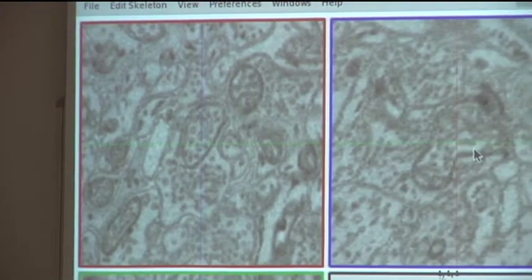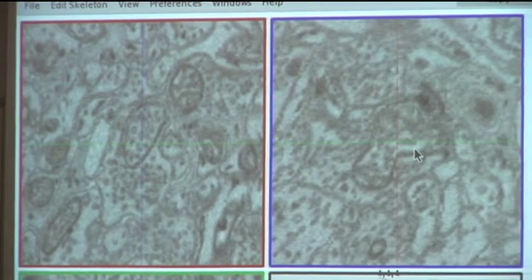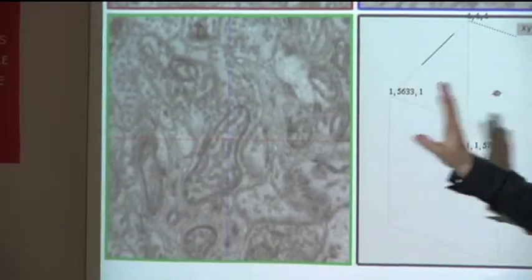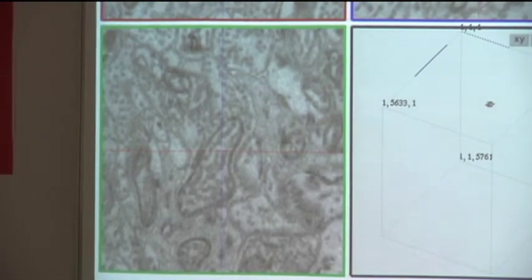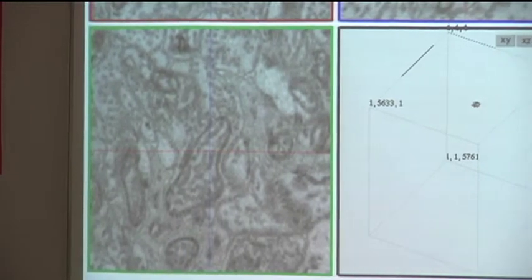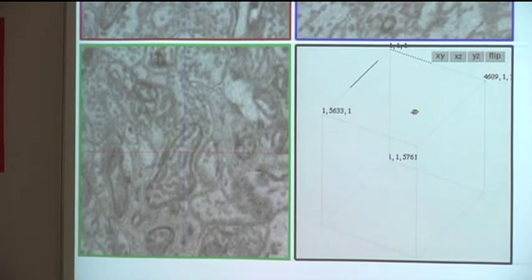It's these membranes. Yeah, it doesn't look like. Well, if you look at the reslice here, you see that they are actually elongated. So one has to be careful about the 3D. That's why we think the 3D is so important, because you really want to have a 3D picture. And what is a kind of longish thing can, in a reslice, look like almost a vesicle. It's not, but it can.